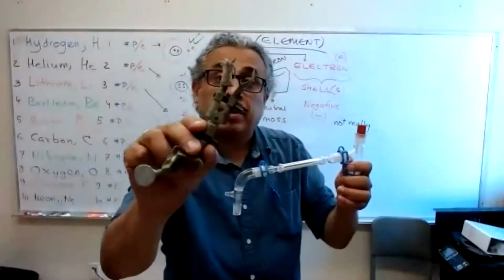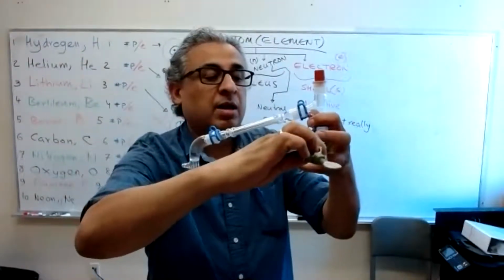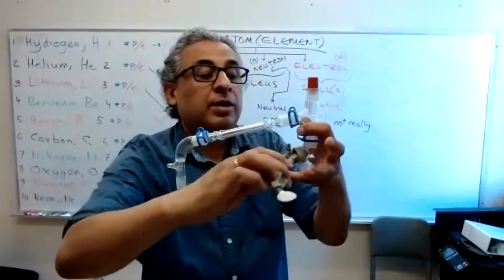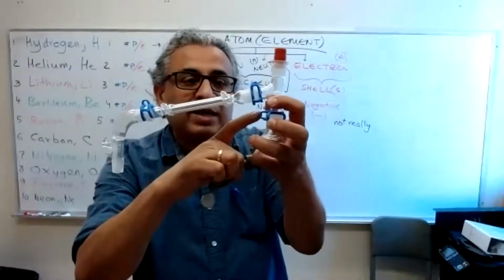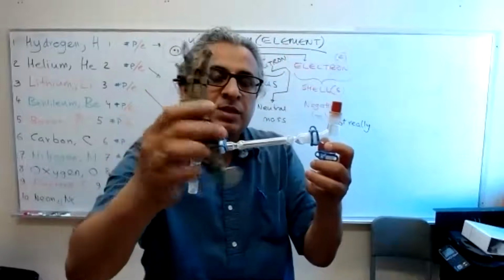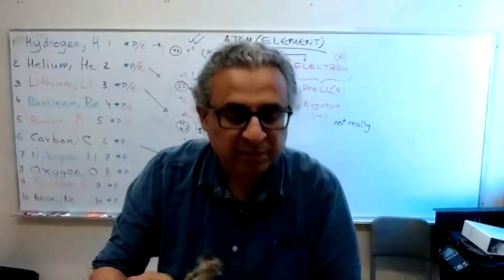That's a clamp, okay? You can clamp it here, you can clamp it here. I hate when someone clamps up here. It's better to clamp at the bottom, okay? If you clamp it here, you may not need the blue plastic clamp here if you're using one of these metal clamps. So I'll explain what this means.